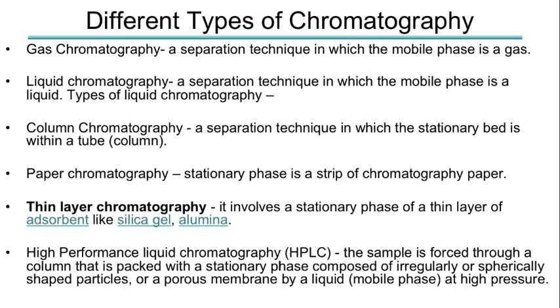There are several different types of chromatography that we could use. This semester we're going to take a look at gas chromatography, and that's going to happen in a couple weeks. There we're going to separate our compounds based on the gas phase, hence gas chromatography. We could also do liquid chromatography, and as that name suggests, we're looking at different liquids. Column chromatography, we would hope separates columns, but it doesn't really work like that. It's actually going to separate pretty much anything we want. In most cases, we're looking at separating different solids that have been put into solution.